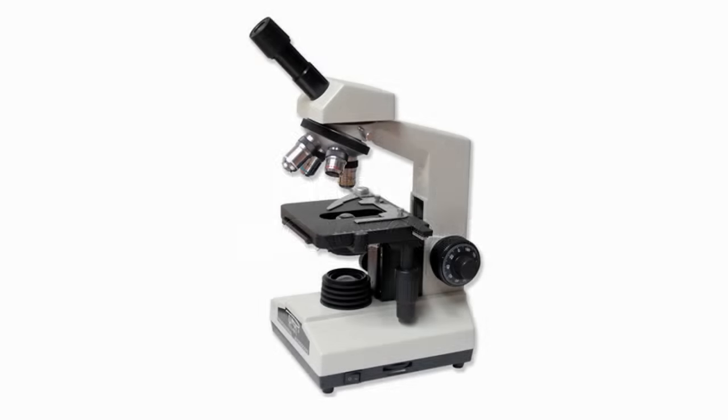This presentation outlines the main parts of the Compound Light Microscope. It also briefly describes the functions of these parts. So, let's begin.